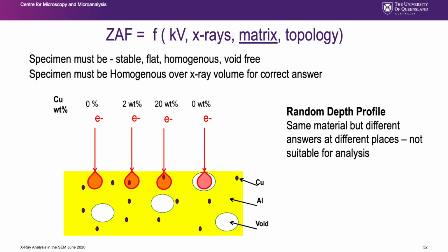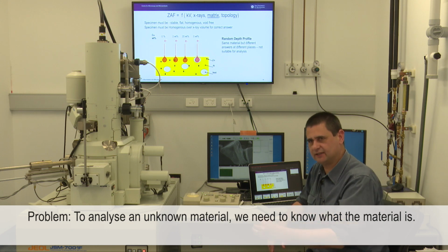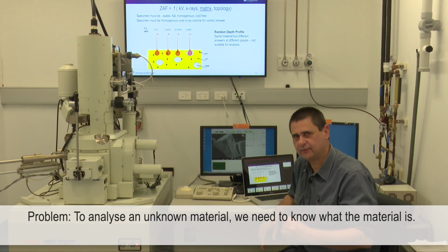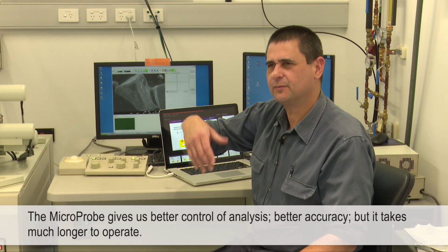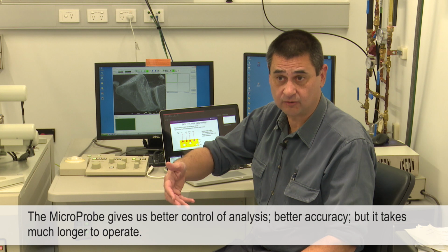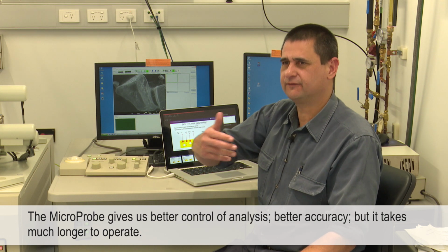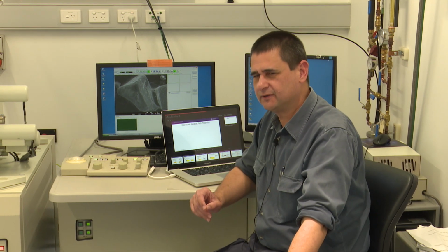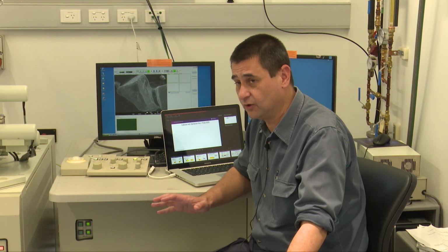That's actually a big problem, because in order to do analysis of an unknown material, you first need to know what the material is. So how do we get around that problem? And again, in standardless quant where you just push the button, this is all done behind the scenes. But on the microprobe, we have better control, which leads to better accuracy, and also a huge amount of time being used up. We do this manually. What we do on a microprobe, and you can do this on an SEM with an EDS detector easily enough, and I've seen some good work done.